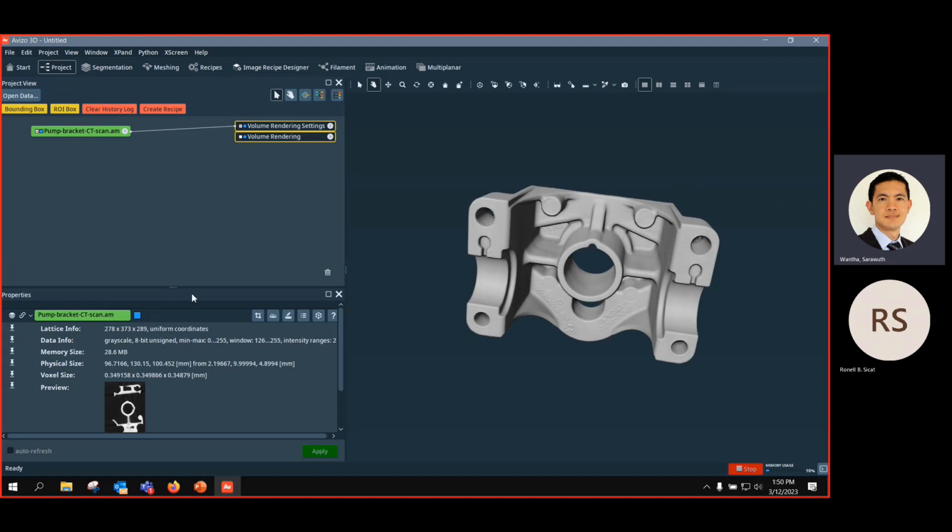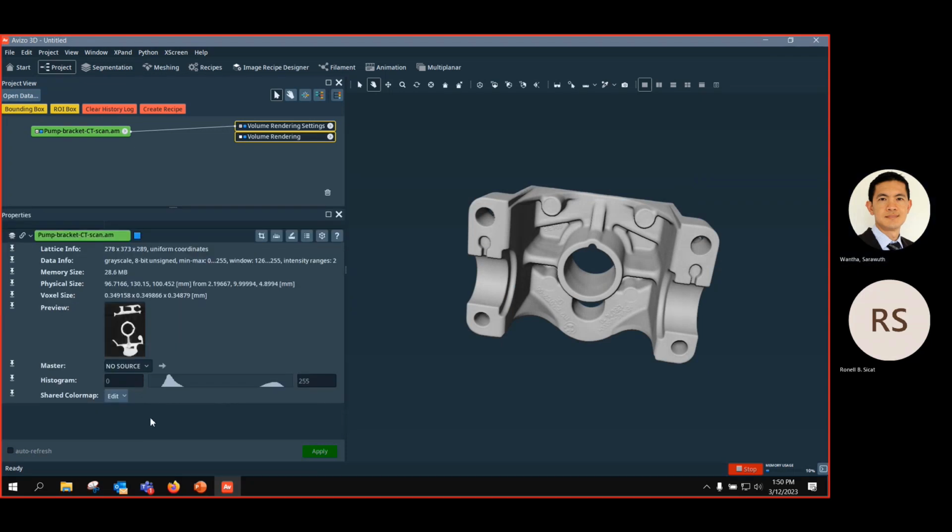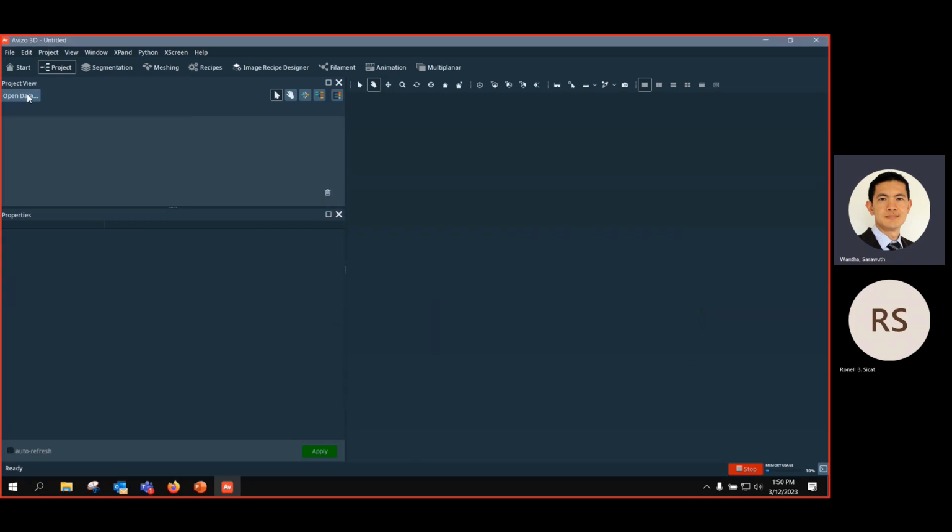If you look at the histogram, you have like 2 curves from the dark and bright. So maybe it's not a good example. I'm really sorry for this because I want to show you the multi-thresholding. You see that there are only 2 because of the background and the bright one. So just Control N and remove everything and open.